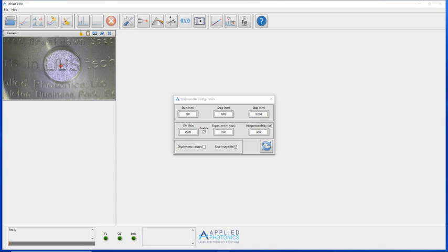The parameters in the central region of the configuration window directly affect the acquired spectra. A typical value of EM gain is displayed, but this can be adjusted within certain limits depending on the intensity of the acquired spectra. If the enable checkbox is unticked, like that, the gain will effectively be set to 0.